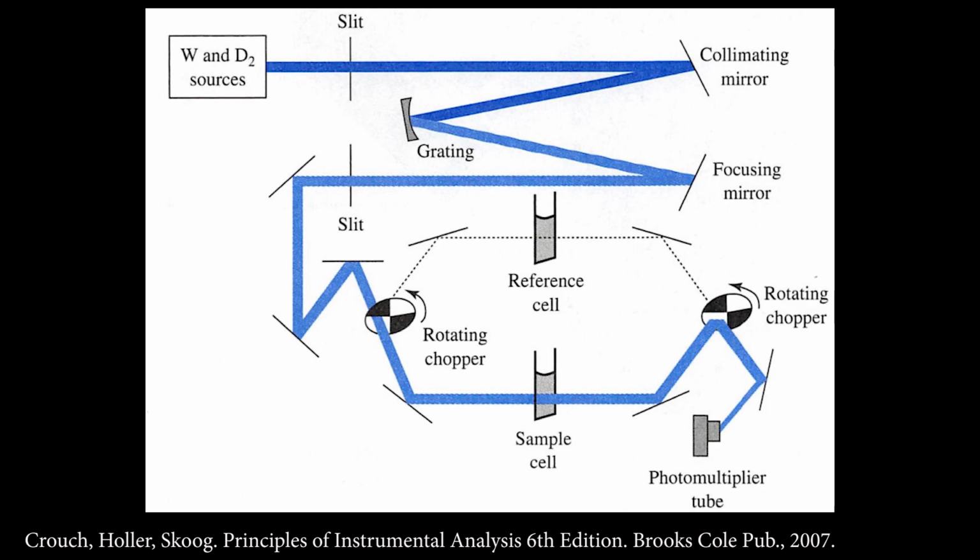Let's look at an actual instrument schematic, a little bit more detailed. This is actually the Cary 100. This is the instrument that we have up in the lab upstairs. You probably never even noticed it. It's over in the corner of the instrument room.